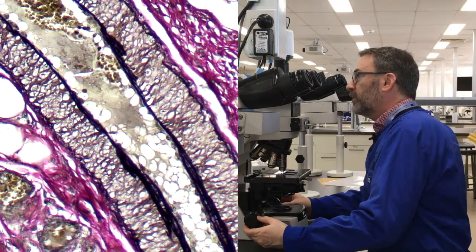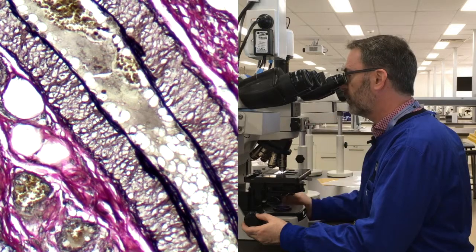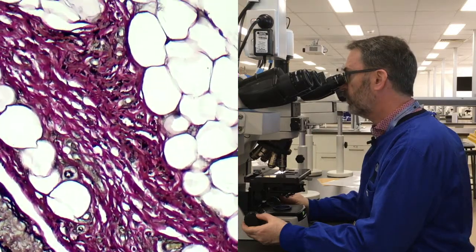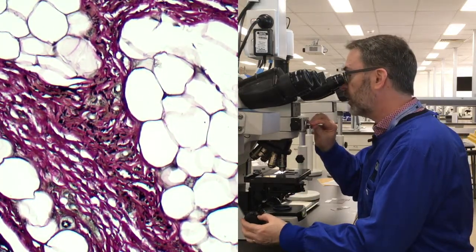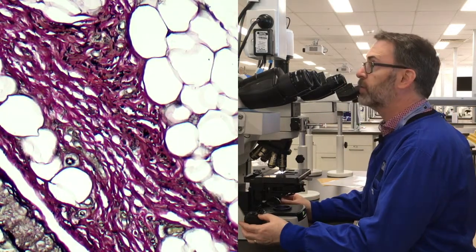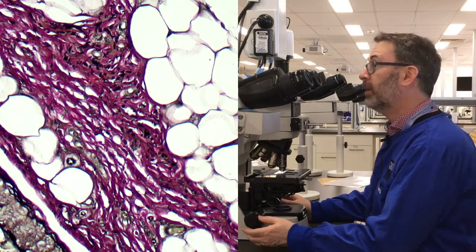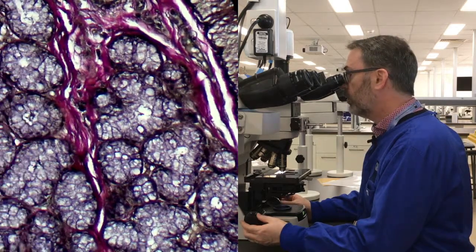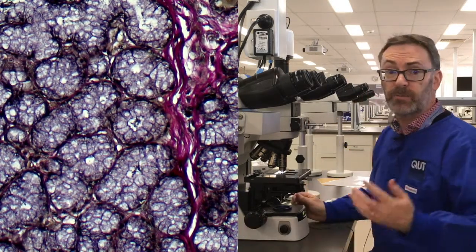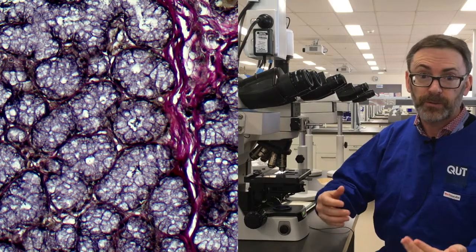Can you see the elastin? Well, kind of — you can make it out just a little bit. It's quite a long structure here the way that artery's been cut, so the internal elastic lamina is evident. Looking into the connective tissue we can make out some fibers running through. But have a look at the collagen — it's very dark. You could say it's a shade of purple or pink, but it's certainly not bright. And the mucin within these acinar structures is clearly very dark.